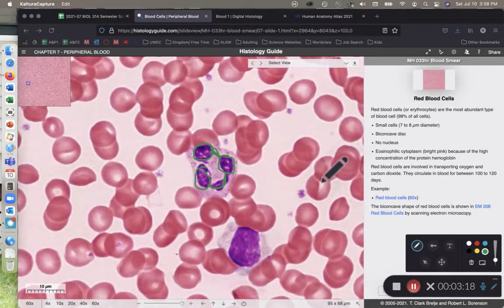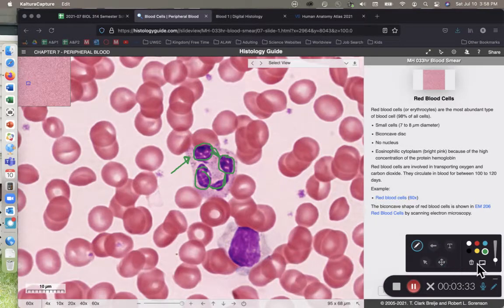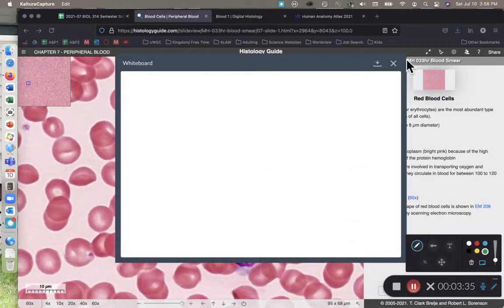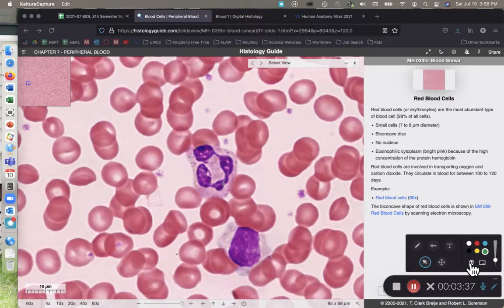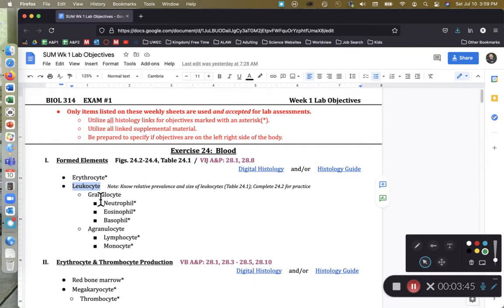Something else worth mentioning about the neutrophil is that it is one of the granulocytes — a leukocyte that has speckles or specks, also known as granules, within its cytoplasm. So we have just looked at a neutrophil, and that is going to be the first granulocyte that we'll cover.